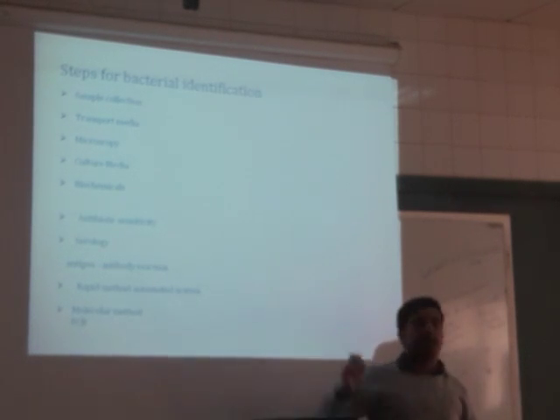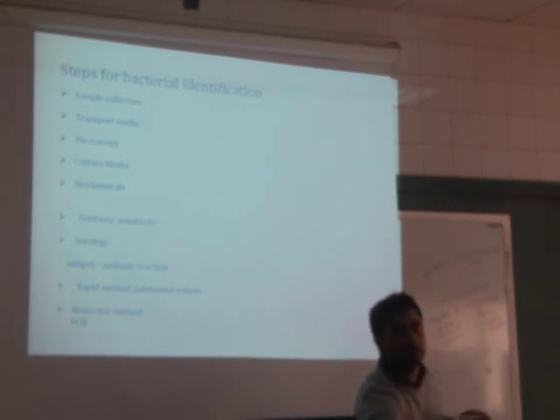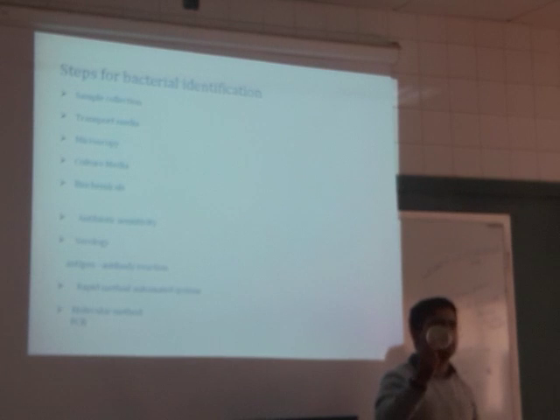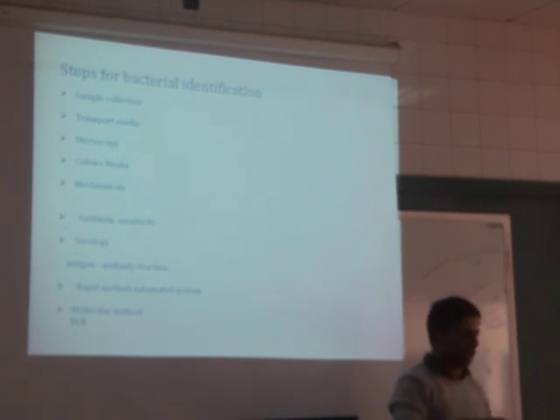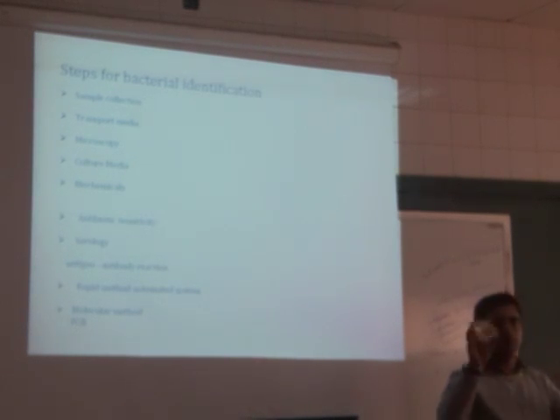One test is called antibiotic sensitivity. We do the test in the laboratory on an agar plate with antibiotics. We prepare a media and we put antibiotics here. Antibiotic discs are circular in shape. I can show you now. Inside we put the antibiotics here. First we put a culture of a bacteria, for example E. coli or Staph aureus, here, and we put 5-10 antibiotics.